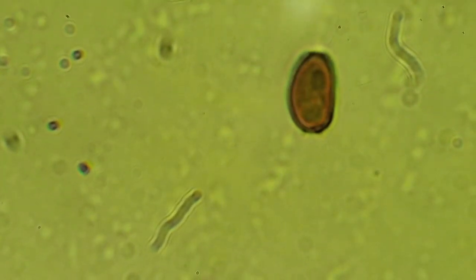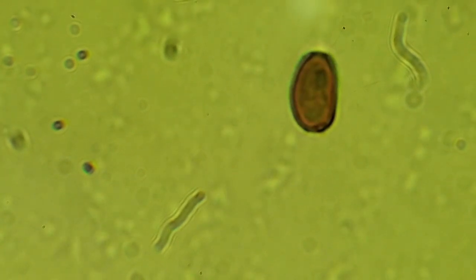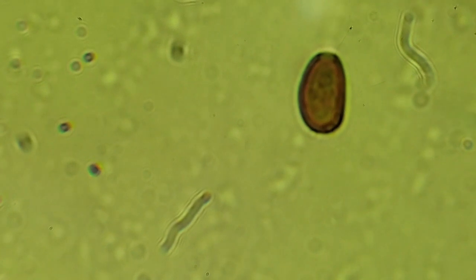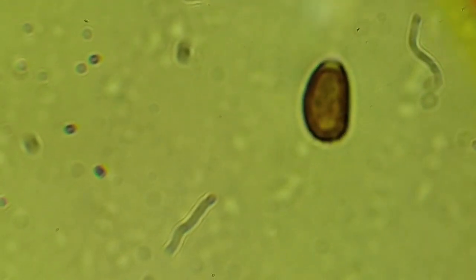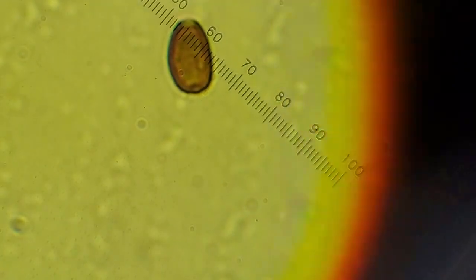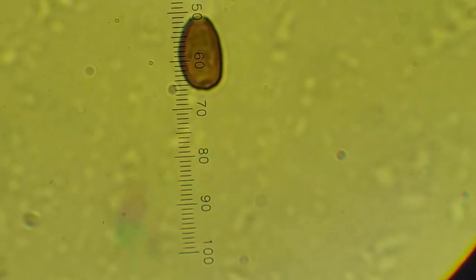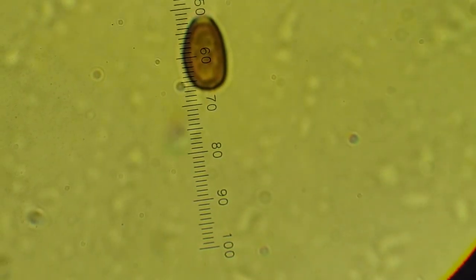Okay, so you can see that the top part, the apex, has the truncated end. There's this little dot at the very bottom right. That's the apiculus. The right side is going to be our adaxial flattening. So when we measure, the easiest thing is to go parallel to that flattening. So let's go back. Here where the spore is, you would move your micrometer so that it is parallel to the flattening.